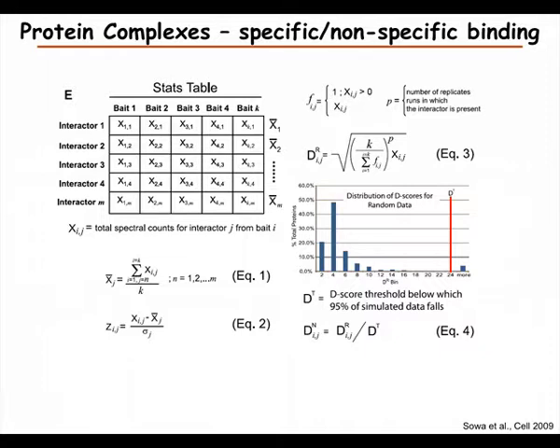So that's a reasonably good way to quantify, especially if the spectrum counts are not very low.